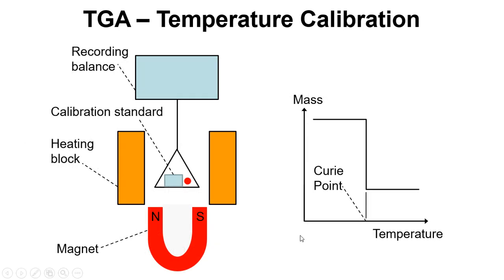If we look at the instrumentation, we have our standard here. This sample pan contains the material that is ferromagnetic, we've got a magnet, and so there's an additional force pulling down on this sample pan due to the magnetic material that's in here.